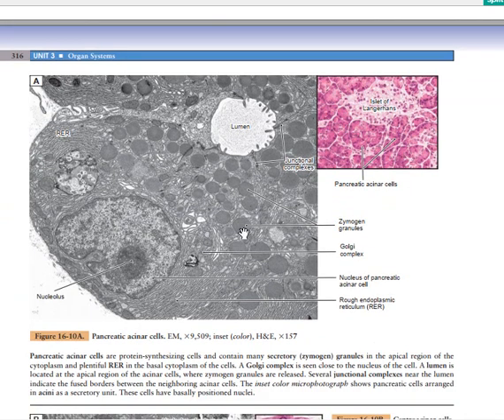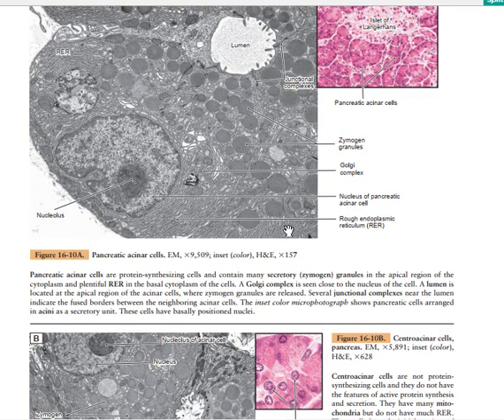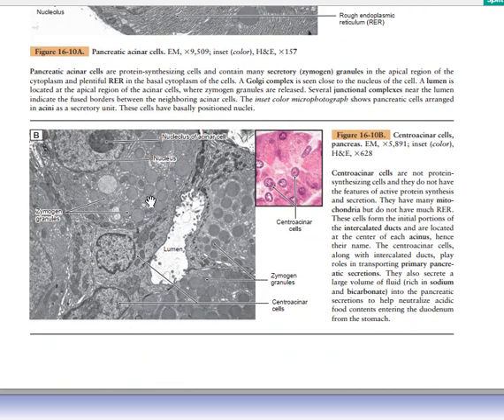So now this is the histologic section, and the electron microscopic view of the pancreatic acini. So the electron microscopic view of pancreatic acini shows a lumen here, and this is the nucleolus of the pancreatic cells. So these are the nuclei of the pancreatic cells with their different granules here. So these are the zymogen granules, and the zymogen granules are going to secrete now the different enzymes that are going to pass into the exocrine ducts of the pancreas. Is it clear? So this is the nucleus of these different exocrine cells.